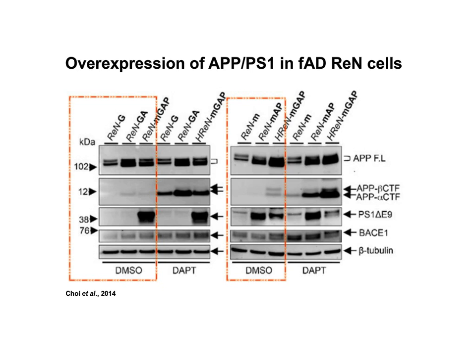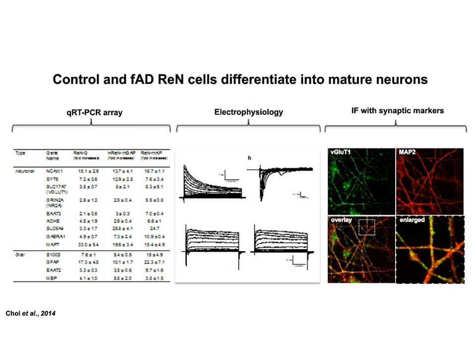We characterized these cells after differentiating for 6 weeks. Using a qPCR array, we see a robust increase of neural markers and astrocyte markers. We also confirmed, as previously reported, that these cells express voltage-gated sodium channel and potassium channel currents. And we also see some synaptic markers in a punctate form, so it looks like it has some synapse-like structure after 6 to 7 weeks of differentiation.